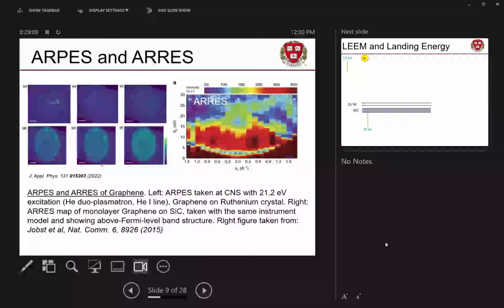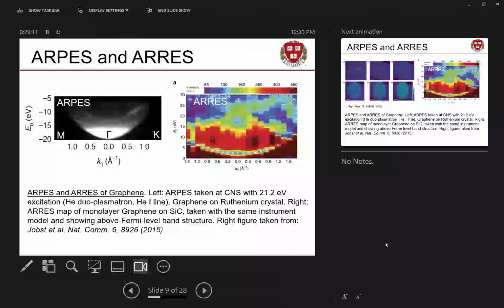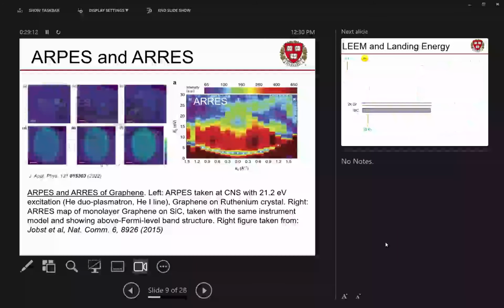By trickery, you can take this fairly simple little diagram here, and you can convert it into a bunch of what are called Z cuts, which are planes in the energy axis that cut through momentum space, and you can see all these interesting features of your valence structure. And if you're familiar with graphene, you'll notice we've got your Dirac cones and Dirac points and so on all represented here. That's real nice.